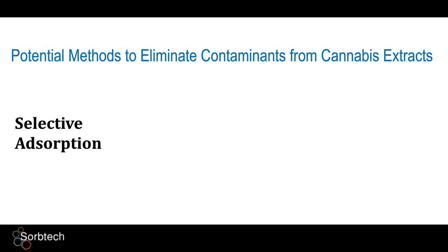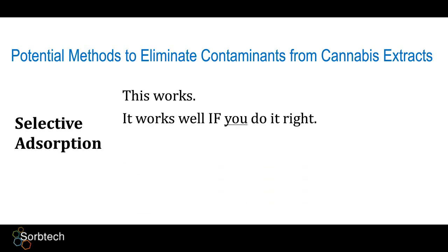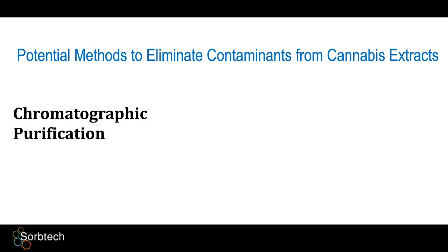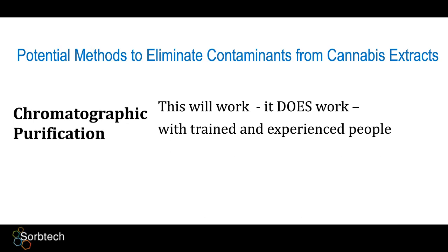Selective adsorption works. It works well if you do it right. That is, there are selective adsorbents that achieve the objective. Then chromatographic purification also works. It does work with trained and experienced people and the right equipment.